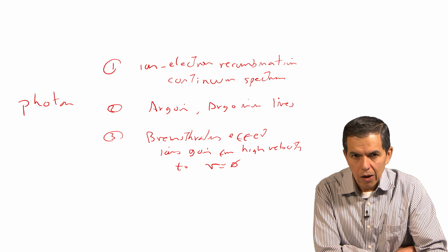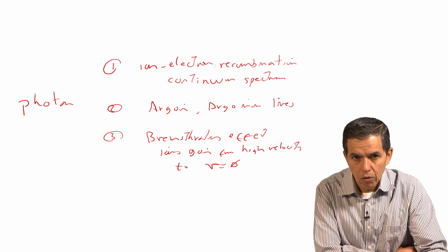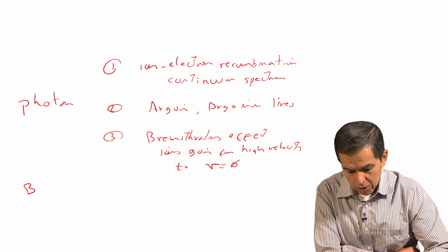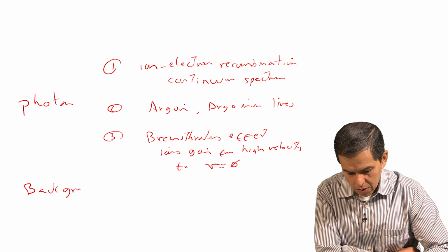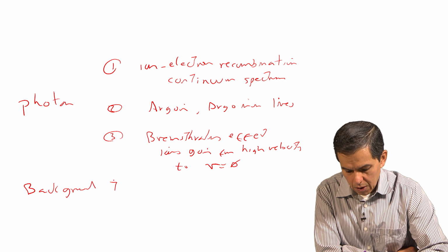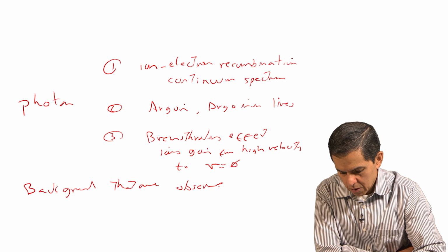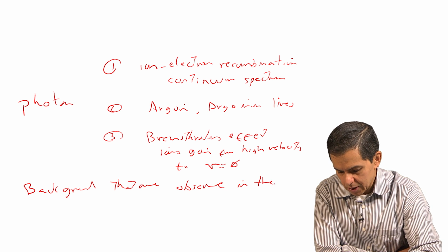So the optical components, or the photons, that are present in a plasma will be the ones that result from this and will contribute to the background that we observe in the analytical signal.